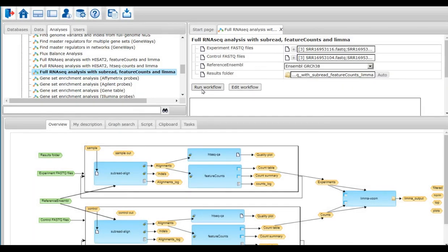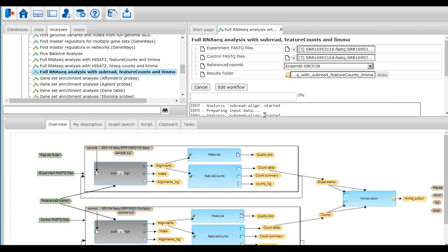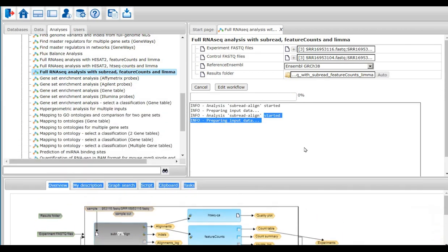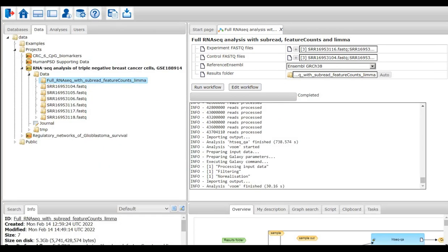Once the input form is complete, I press run workflow. The workflow starts executing. Depending upon the size of the FASTAQ files, the workflow takes a couple of minutes to complete. The workflow is now complete.